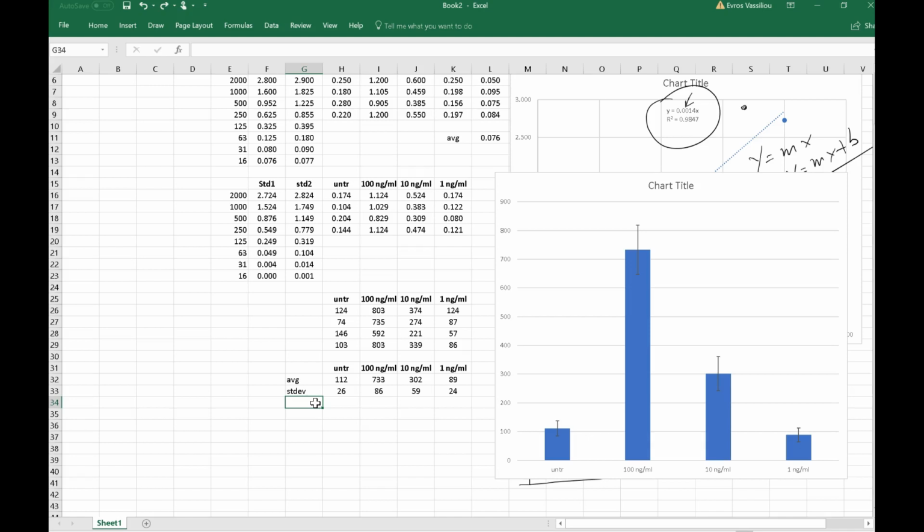And what do I mean by statistical significance? In our case, if I give the cells 100 nanograms of LPS, do they make more TNF-alpha? That's a question. Between you and me, I know it makes them make more TNF-alpha. But let's assume that this was a drug which I didn't know what the behavior is. You getting it? So, I'm going to ask my computer to do a t-test. So I'm going to go under my function key.